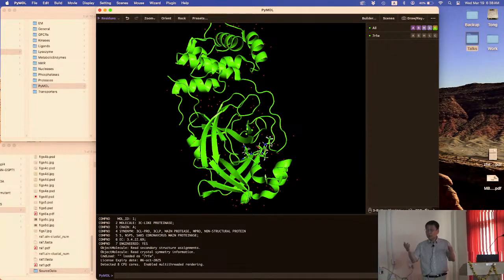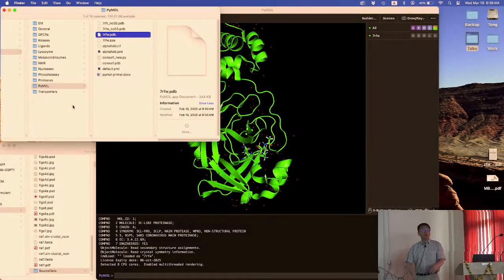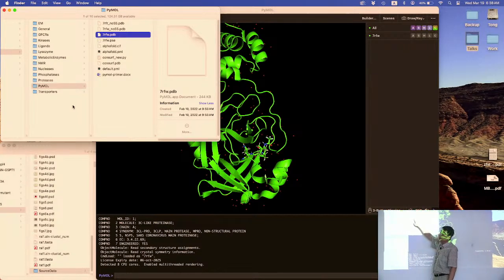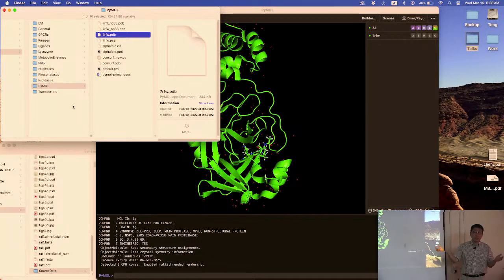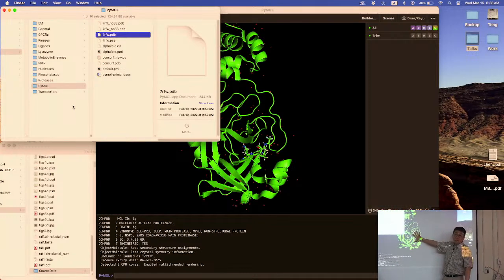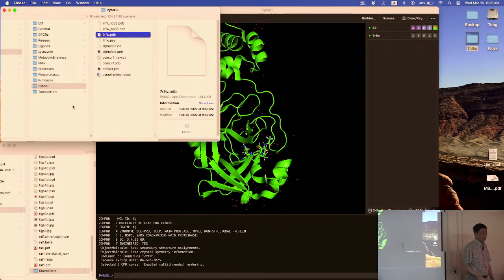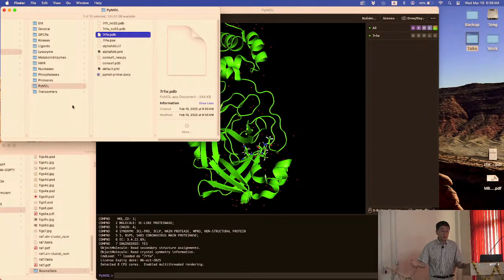Okay, so there's a PyMol primer as well. Have you looked at it? I mean, I spent a lot of time writing it, so you better pay attention to it. Just kidding, right here. So look at that. Sections 1 and 2 are general commands about PyMol you should learn yourself. Section 3 is the structure, which is a SARS-CoV protease bound to a ligand, which is a drug on the market against SARS-CoV. So that's the idea. But today, let's just do something to get you familiar with it or get you started. So then you can learn more on your own as well.